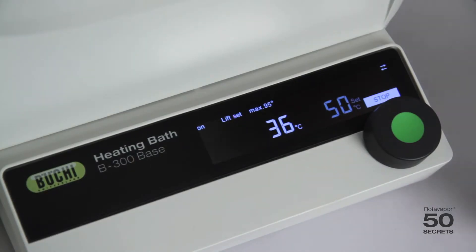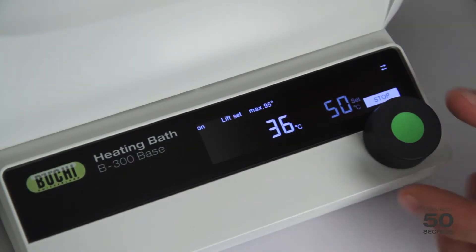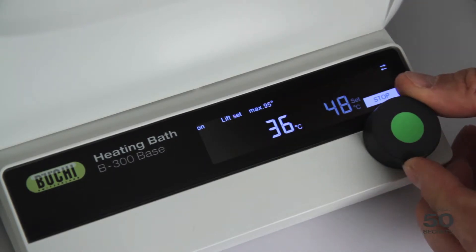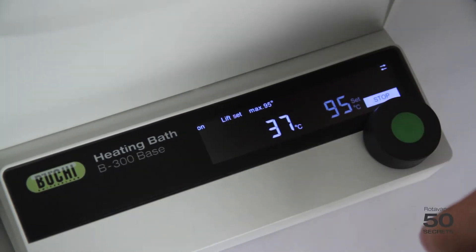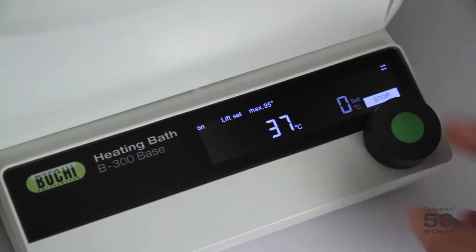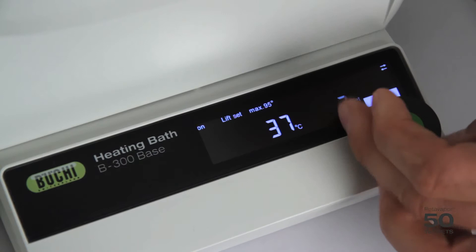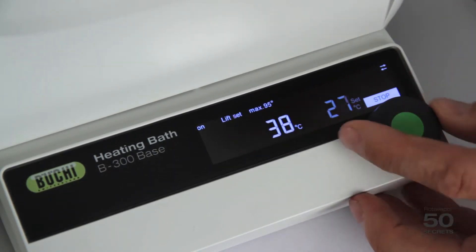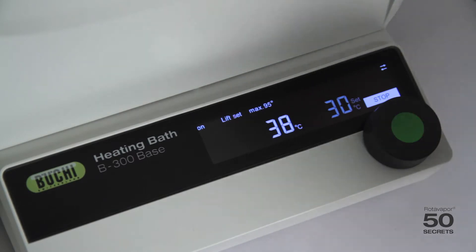The second function is to set the temperature. You can easily do this by rotating this wheel. If you do a fast rotation it goes fast — to 95 or to 0 — and if you do a slow rotation you can easily find the exact point you would like to have.